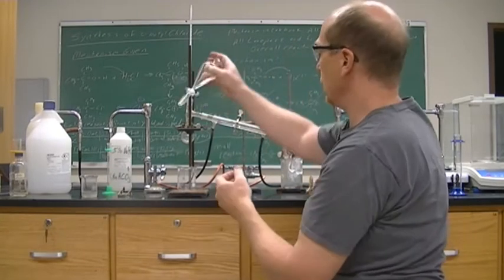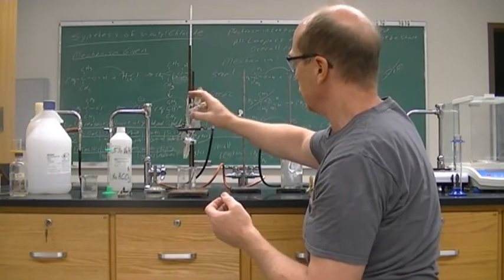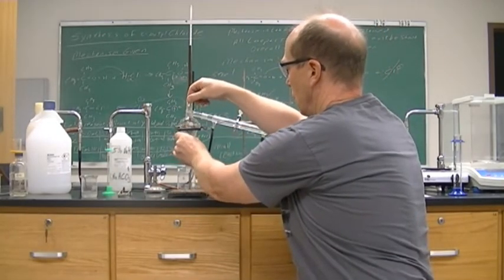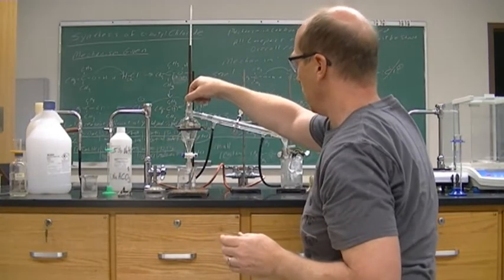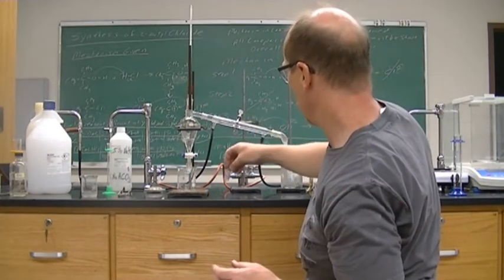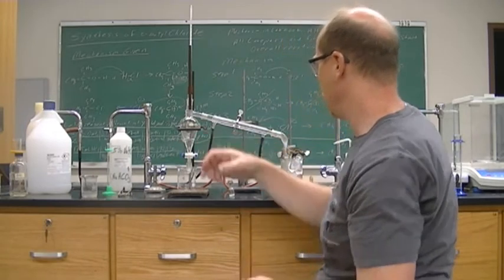All right, and so we'll let that separate. Again, top off so that we can easily remove the liquid from the bottom.